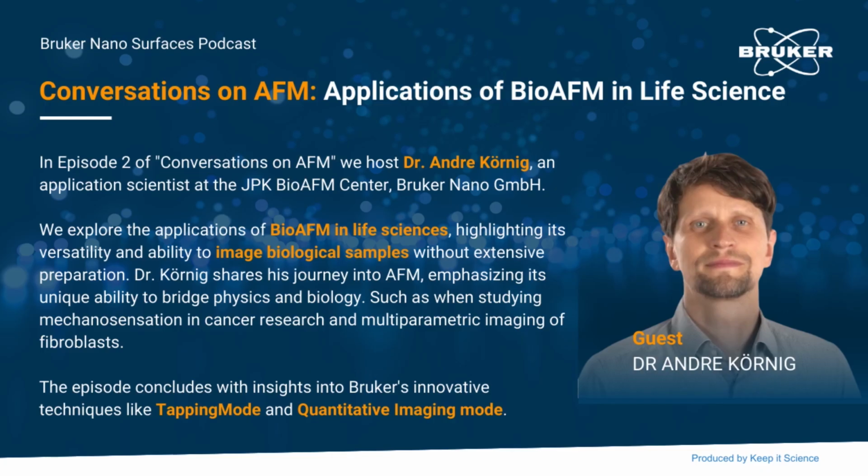Interesting. So it's really more like an exploration mode, but also a high-end data analysis mode. In the end, it's what you want to do with it. Exactly, you can just start it, and then it depends on how deep you want to analyze it. And the only thing, as I said, is that you don't get the 50 frames per second. This is then another mode.